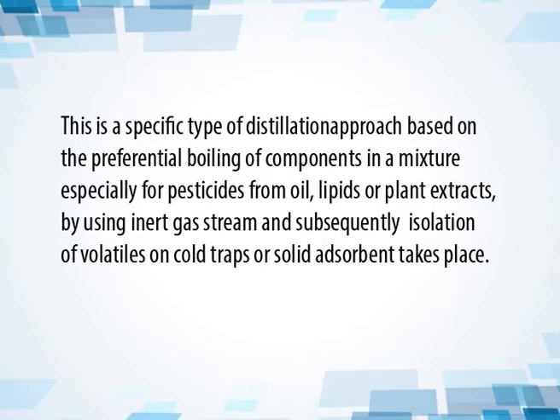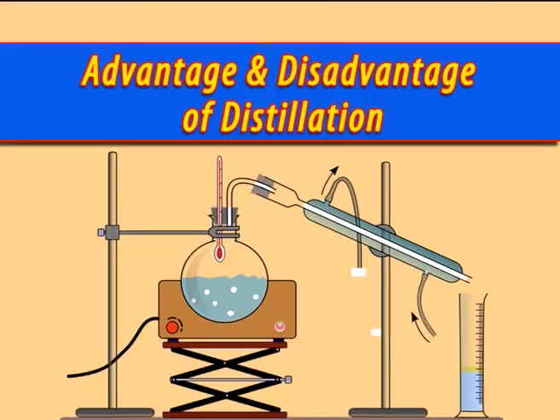This is a specific type of distillation approach based on the preferential boiling of components in a mixture, especially for pesticides from oil, lipids or plant extracts, by using inert gas stream, and subsequent isolation of volatiles on cold traps or solid adsorbent takes place.